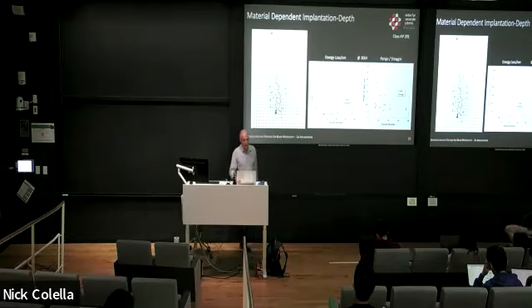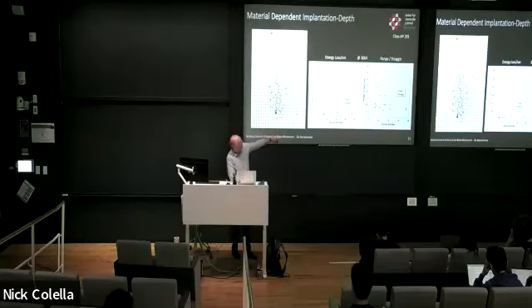And so ultimately, to give you a sense of dimensions, if you look here on the rightmost side, the range, that is sort of the median implantation depth of these ions in the material, right? So we are talking here about the order of tens of nanometers implantation.